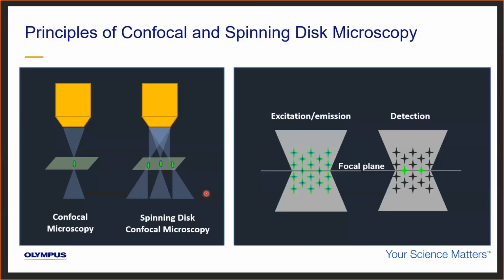Now, as you already know, confocal and spinning disk microscopy both use epifluorescence geometry, in that one objective is used to send excitation light to the sample and collect the emitted fluorescence. Optical sectioning is achieved by the presence of pinholes. However, the entire thickness of the specimen in the Z-plane is still illuminated with light multiple times, which can cause photobleaching. The sample is scanned one point at a time, rendering acquisition of volumetric images very long.